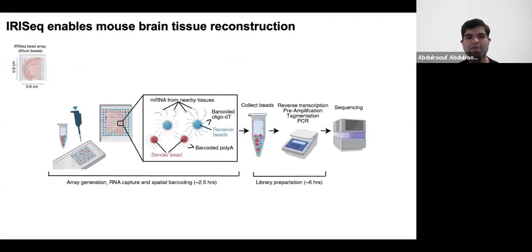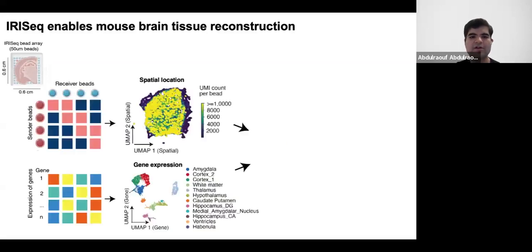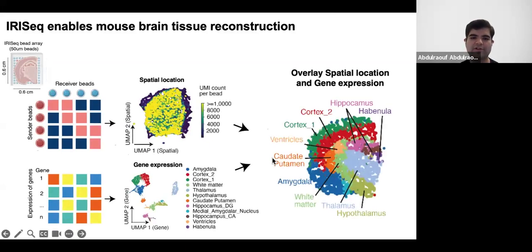So we applied this to a mouse tissue section, and we just followed the sequence of experiments I described earlier. And we are able to construct a whole map of the array, and here I'm laying over the UMI count, and here you could see beautifully the architecture of the tissue, where the tissue sits and where the RNA is very high density. And it shows that there's not much diffusion as well. It's a very restricted localization and shows the shape of the tissue as well.